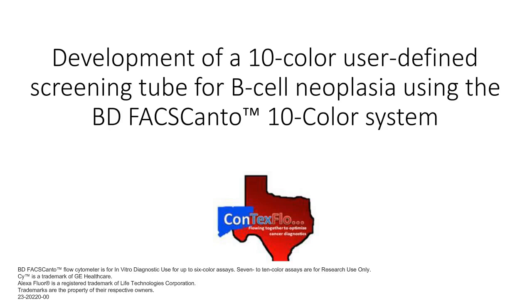Okay, so we have one more question, and that is, why did you not just adopt Euroflow? Well, I think Jeff had addressed this in terms of the sentinel approach. I think we were uncomfortable having multiple antibodies in the same channel because phenotypic aberrancies, either gain of antigen that we don't expect or vice versa, could potentially throw your entire gating strategy off and mislead you. So we weren't comfortable with that approach as a group.